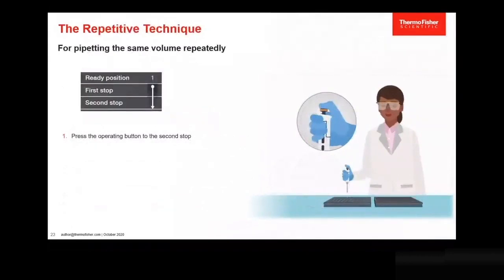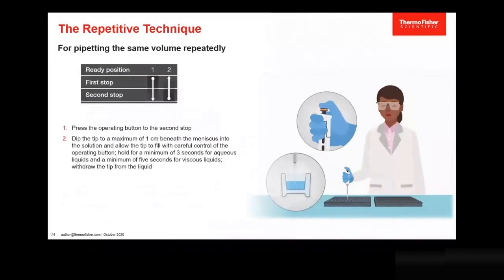The repetitive pipetting technique for pipetting the same volume repeatedly. Ideal for pipetting master mix into a qPCR plate, for example. Press the operating button to the second stop. Dip the tip to a maximum of one centimetre beneath the meniscus into the solution and allow the tip to fill with careful control of the operating button. Hold for a minimum of three seconds for aqueous liquids and a minimum of five seconds for viscous liquids. Withdraw the tip from the liquid.